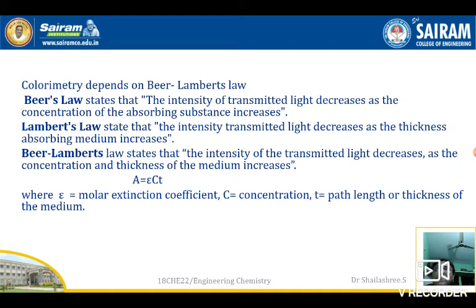What does Beer's law state? The intensity of the transmitted light decreases as the concentration of the absorbing medium increases. What does Lambert's law say? The intensity of the transmitted light decreases as the thickness of the absorbing medium increases. I told you even in class, I think you remember.